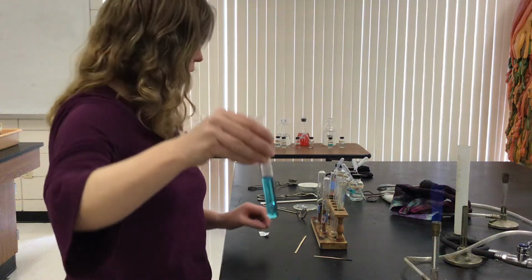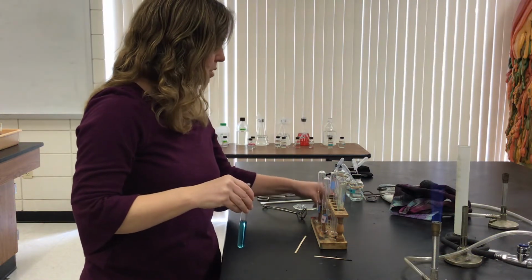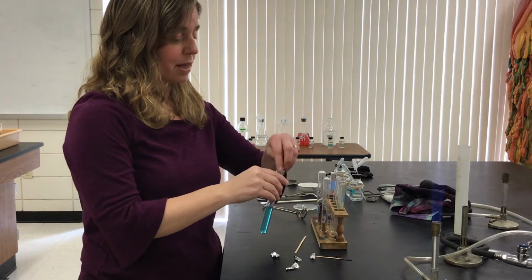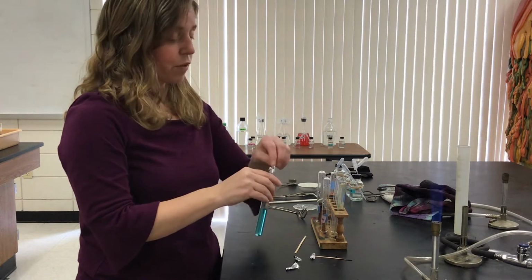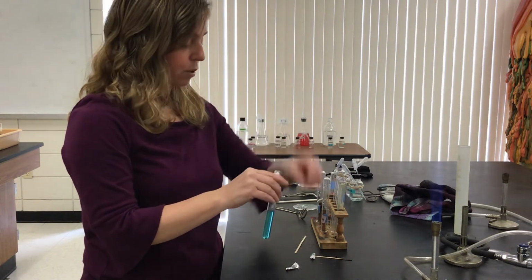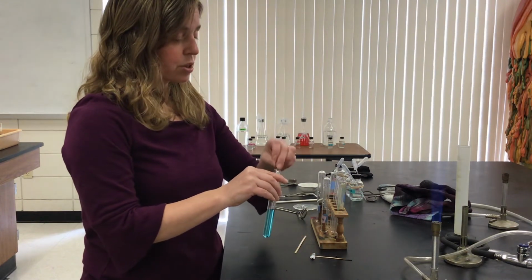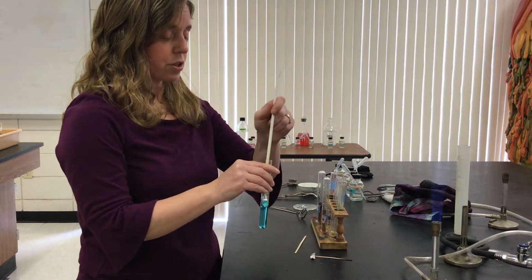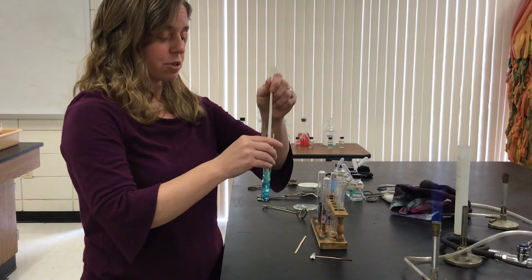It's blue in color. And then I'm going to take some pieces of ripped up aluminum foil, okay, and I'm going to add them to the test tube. So a single replacement reaction in which aluminum is going to react with copper chloride and produce aluminum chloride and copper. So now I don't even have to heat this reaction.